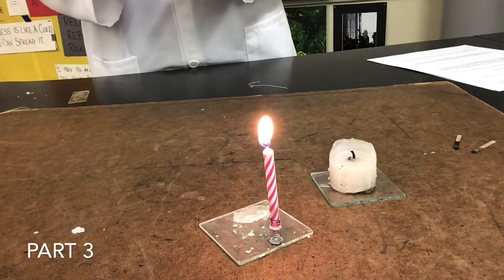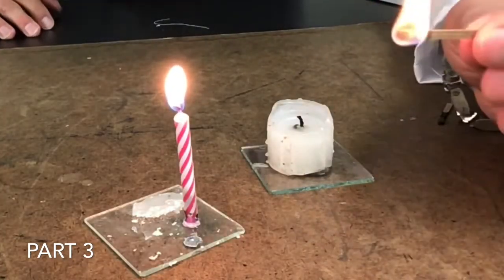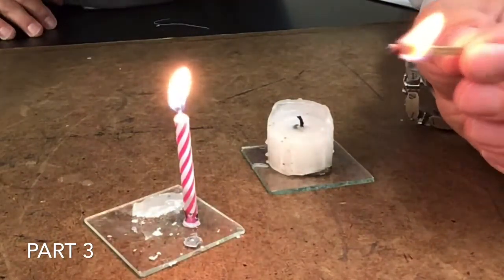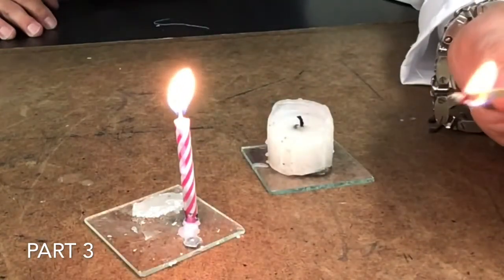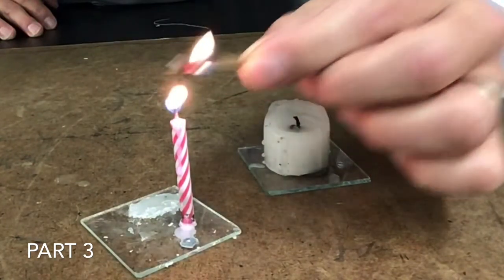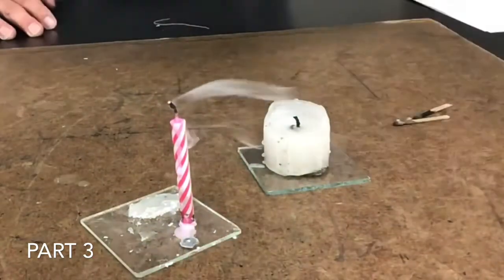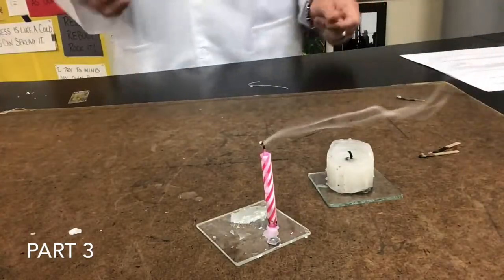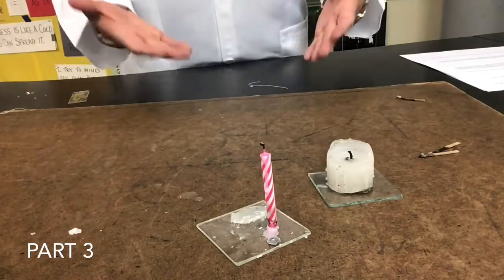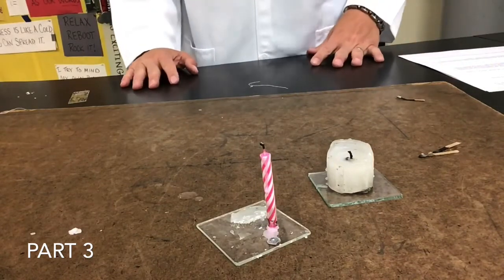The flame has been lit on the birthday candle. I've got my one match ready over here. I'm going to blow out the candle and see if I can relight it quick without touching the wick. Did you see that? It's like the birthday candle relights quickly without the flame actually having to touch the wick. Go ahead and write your observations down and your thoughts. Remember to read the lab to see what it's asking you to do.